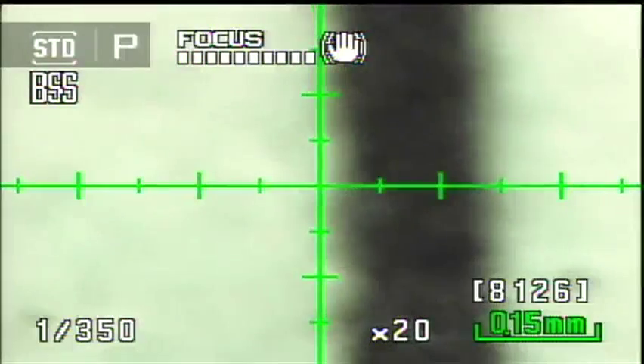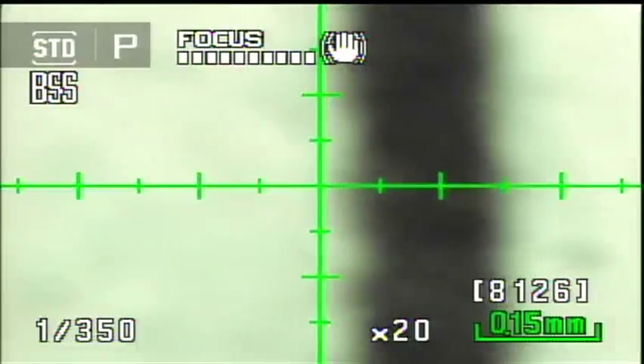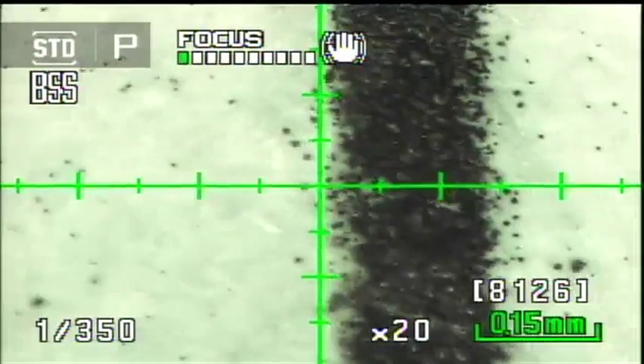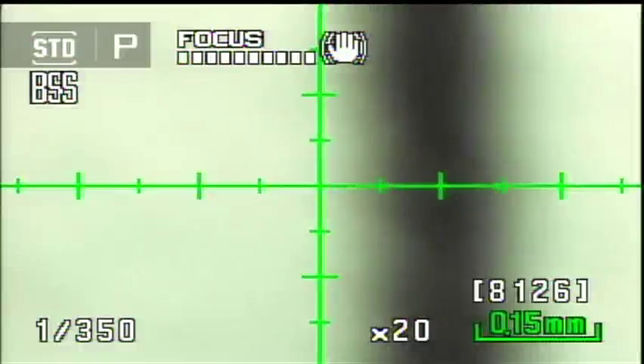Another thing worth noting: at 20x zoom, the scale in the lower right corner has changed. At 1x it was 3 millimeters, but now it's showing a scale resolution of 150 microns, automatically updating to reflect the zoom level.